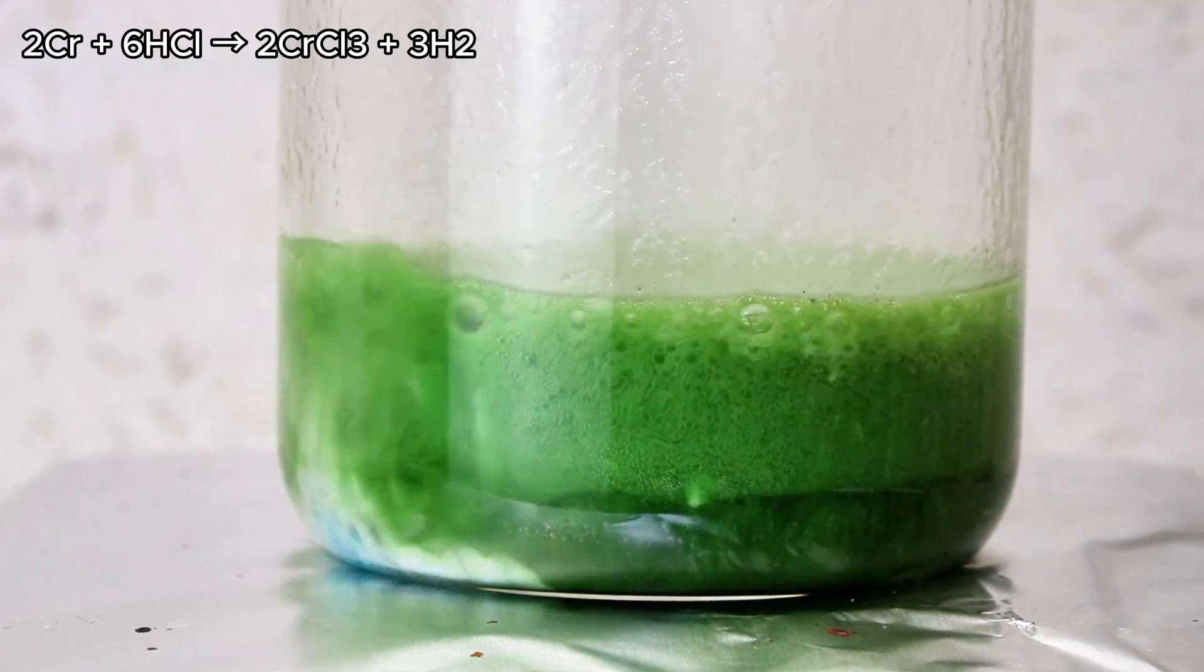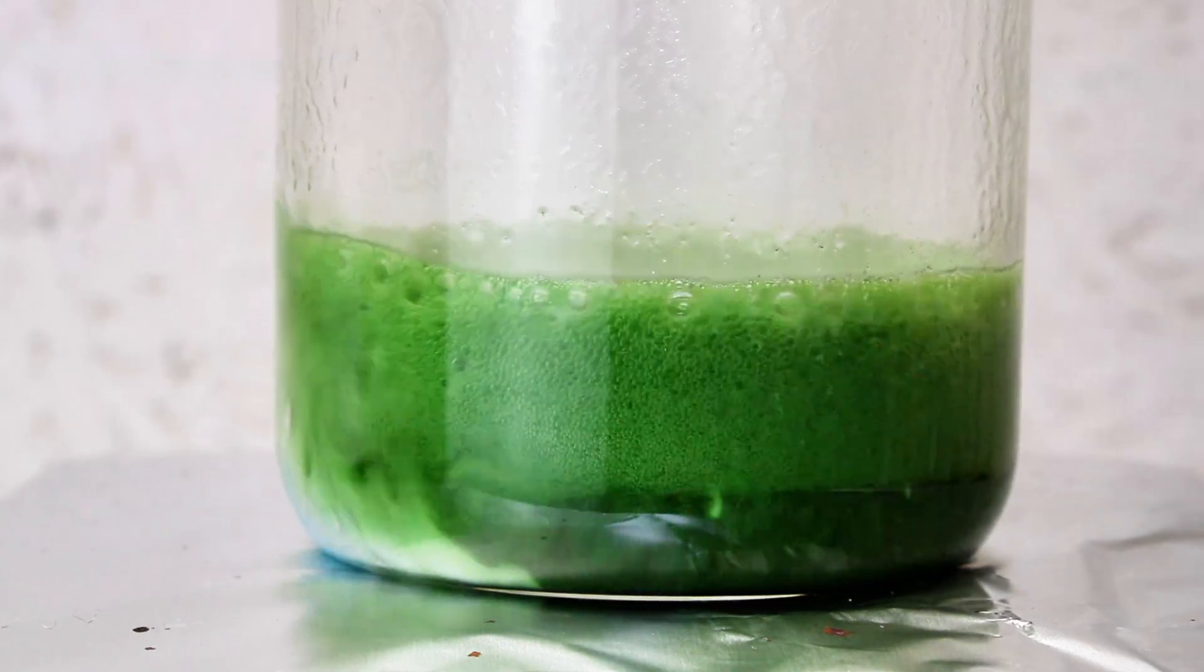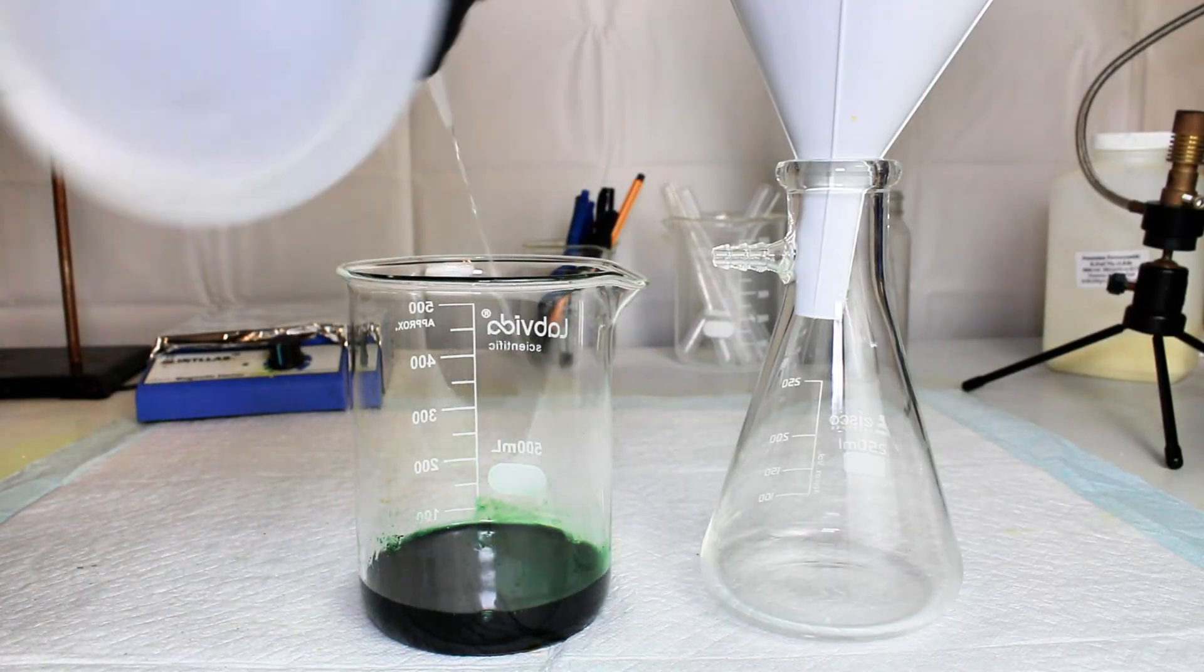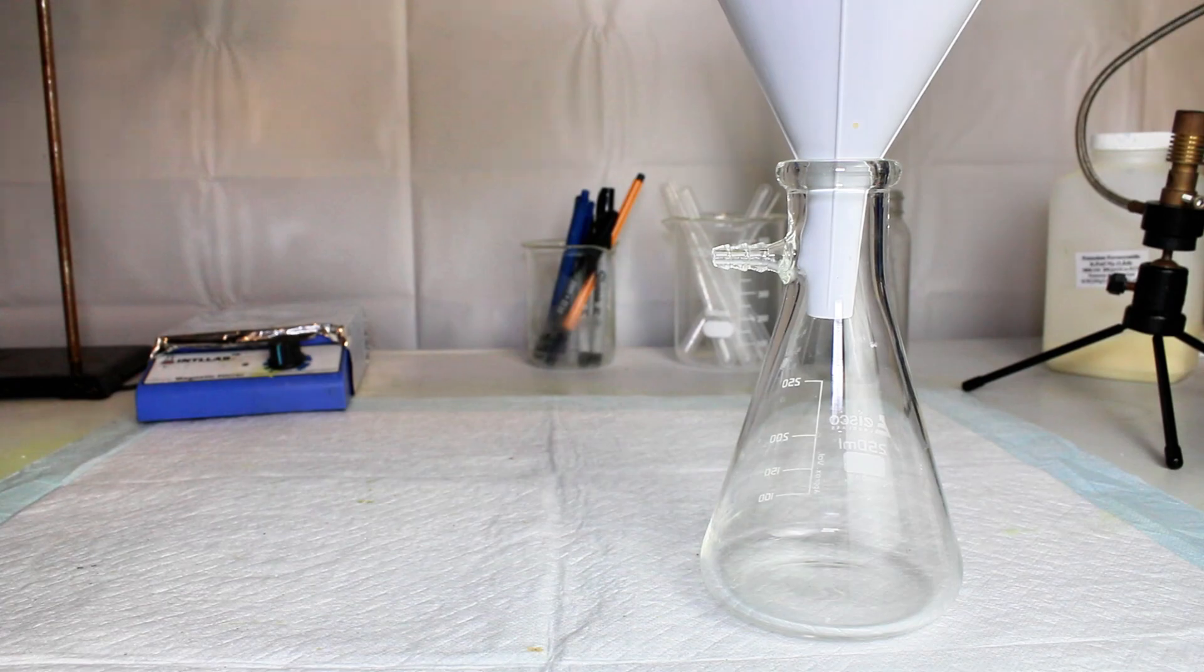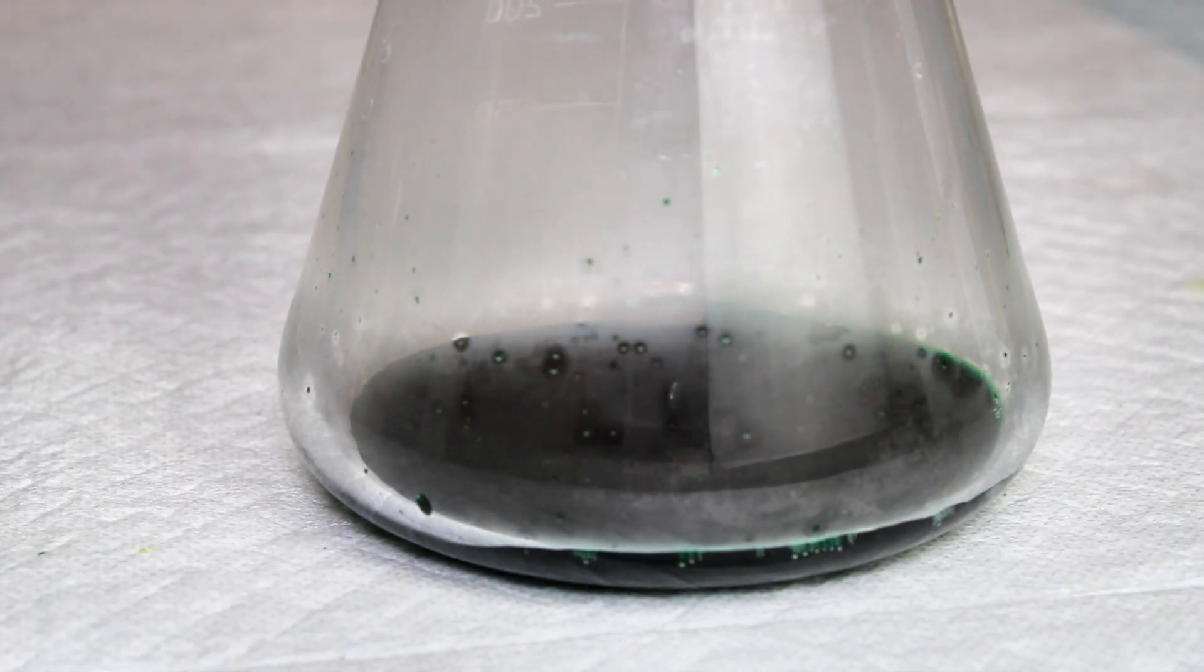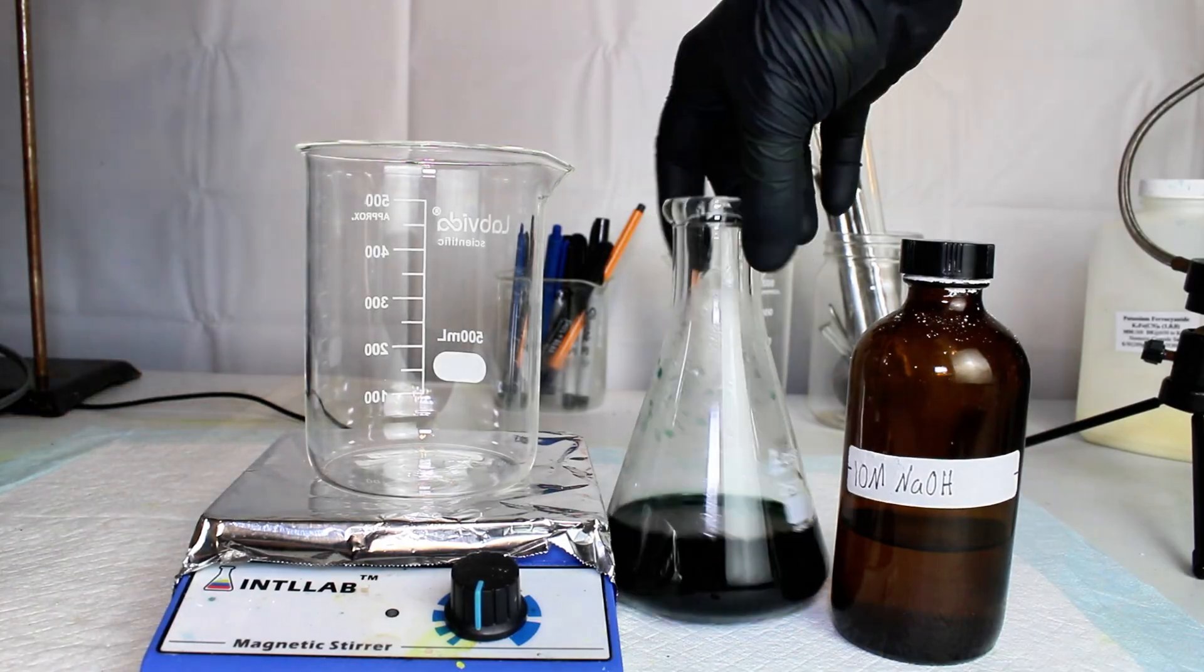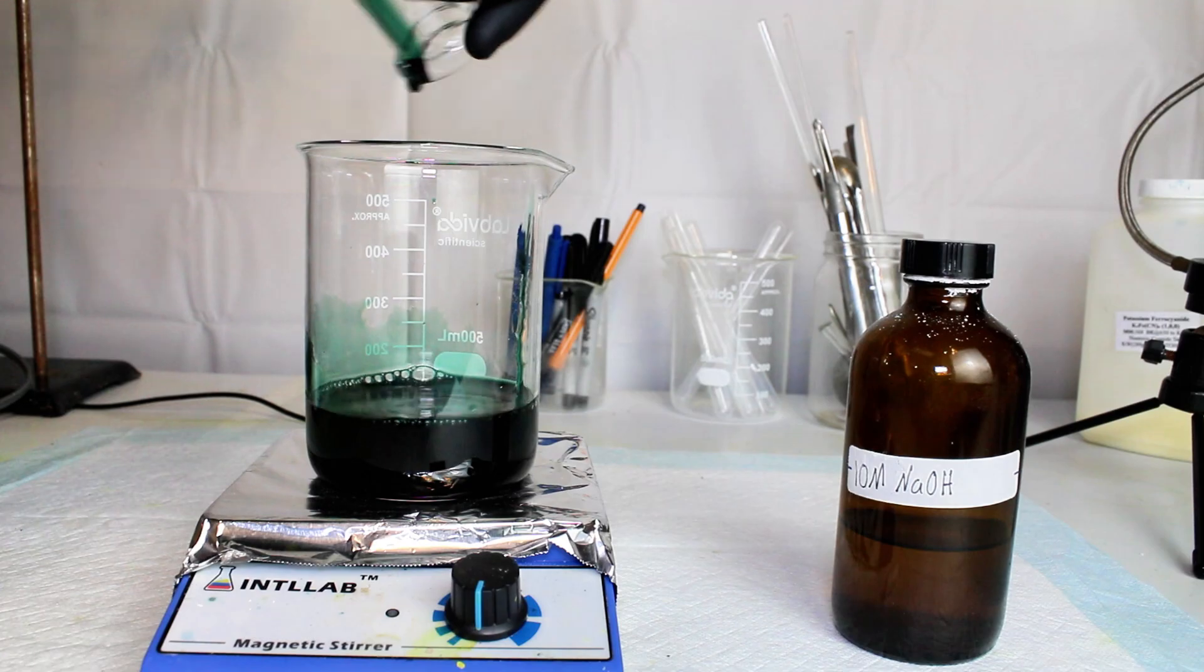Interestingly enough, you can see a bit of blue at the bottom left of the beaker as the chromium dissolves, and that's a bit of chromium 2 chloride that exists only very briefly. Once all the chromium had dissolved, I went ahead and passed the solution through a coffee filter to make sure there was no tiny undissolved pieces, and then I transferred the filtered chromium chloride solution to a beaker.